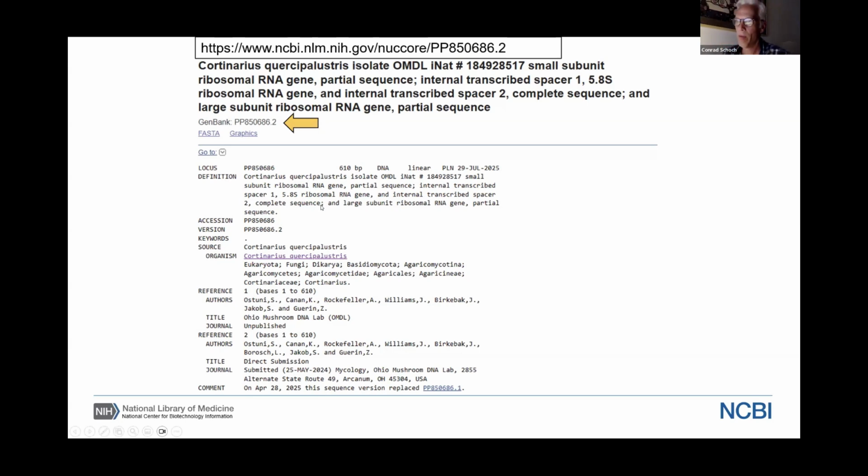So we just caught this really recently updated sequence before BLAST could actually update it. And eventually you will see it in the BLAST database. But if something like this happens, you've got to decide now whether you can trust this information.